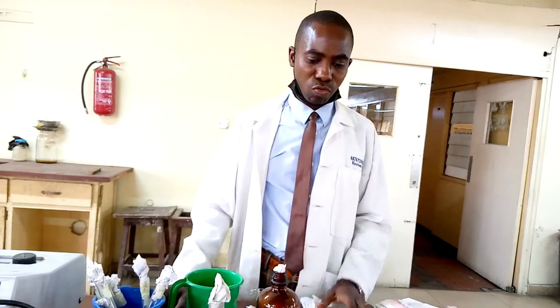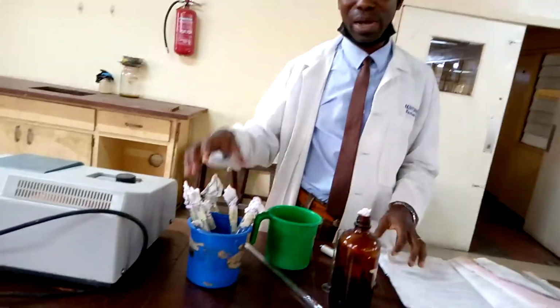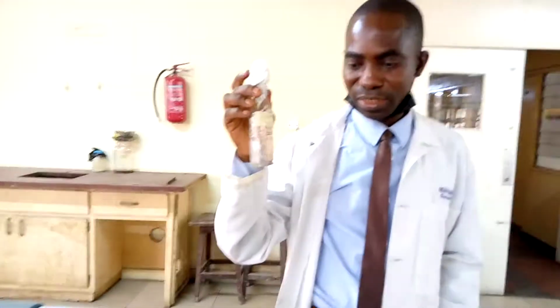So today we want to see how we can estimate the amount, or the concentration, of amino acid present in a given sample. Let's assume that we're analyzing for an amino acid. We prepared leucine, 5 milligram per mil. We have prepared it, you can see it.